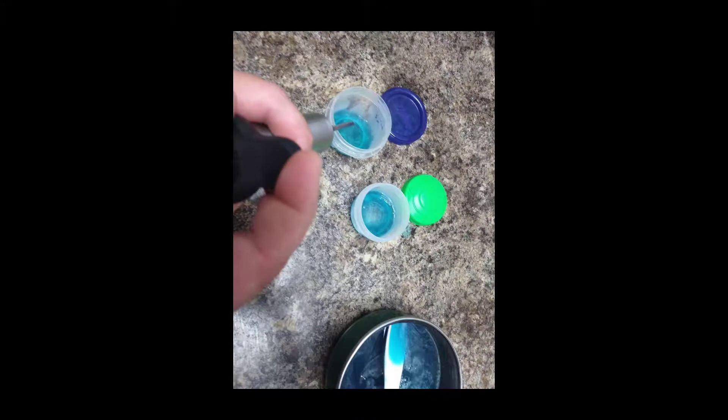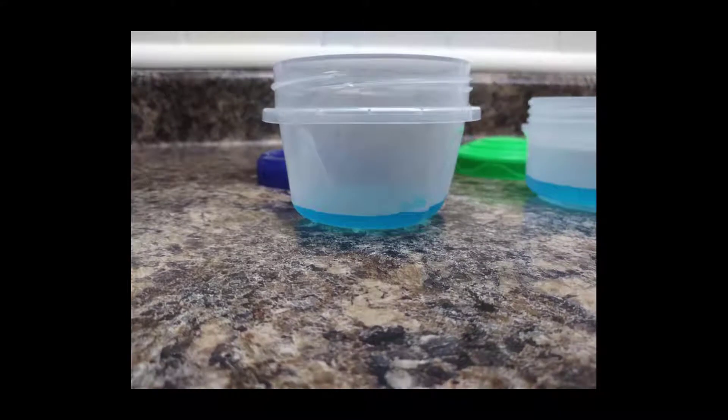Once the agar is ready, put a thin layer in each plate. I like to use the basin strands — it'll help you measure out the amount you need in each plate and also helps so you don't make a mess.